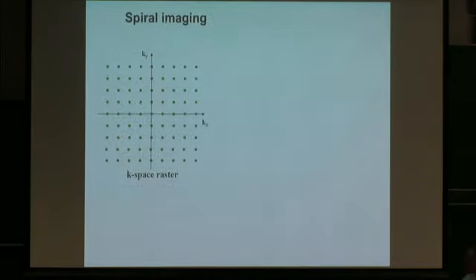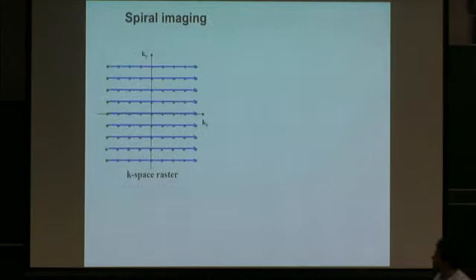So this is where we're looking at different methods. What we have been doing previously is at least acquiring information on this rectilinear grid. It's very nice in terms of reconstruction because you can just, with fairly little modification, do a Fourier transform to your data if it's all on a regular grid. But it's probably not the most efficient way.